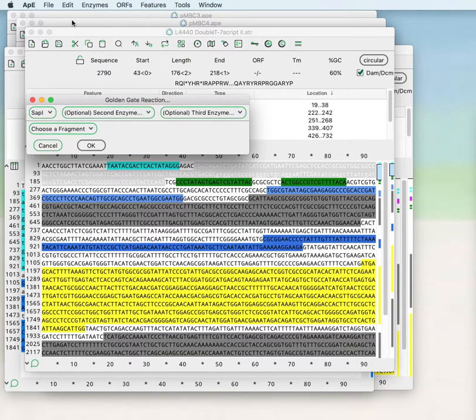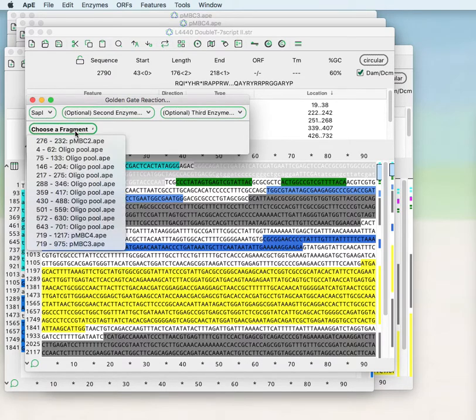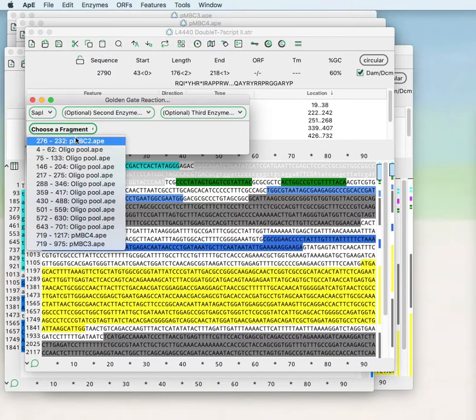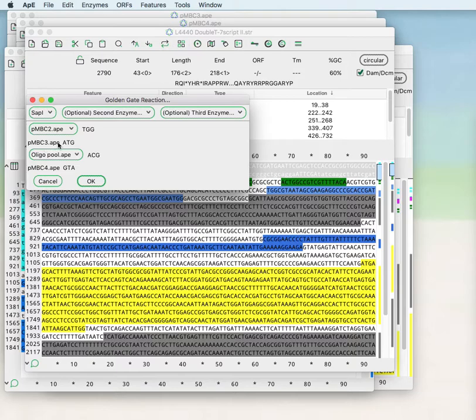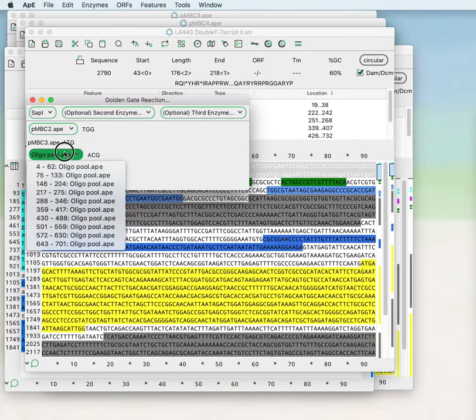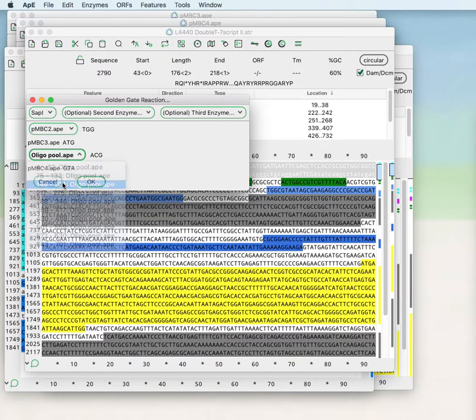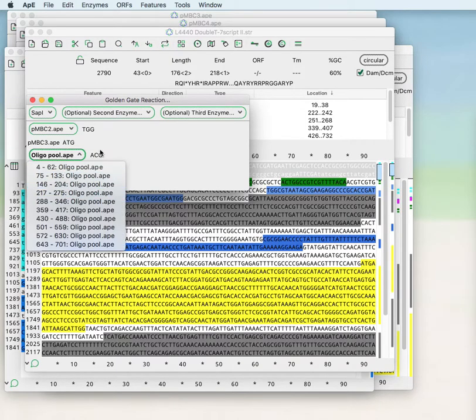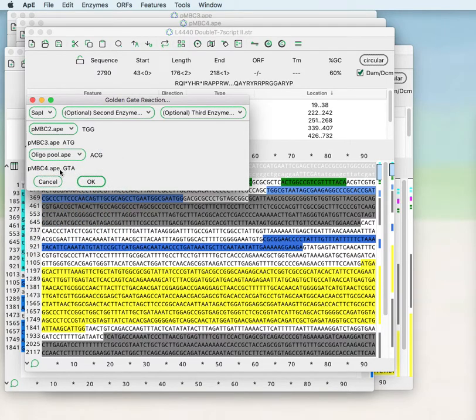I have already opened the four fragments that get put together to generate the final product. And now you can see that the Golden Gate assembly tool is giving me the option of choosing any one of these starting fragments as a potential Golden Gate input. So if I use PMBC2, it then tells me that there is a TGG single strand overhang that then ligates to PMBC3 that then ends with an ATG overhang.